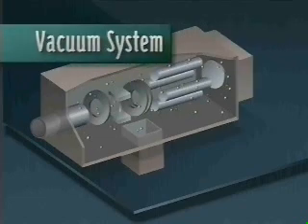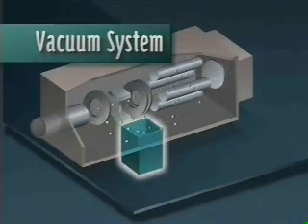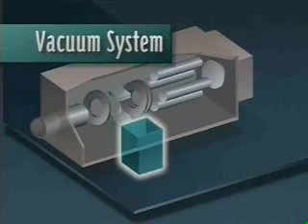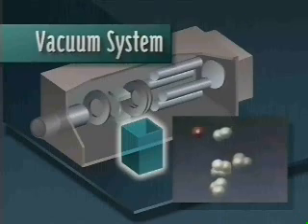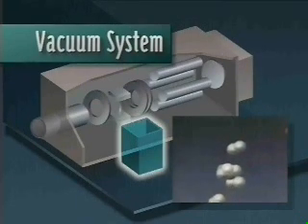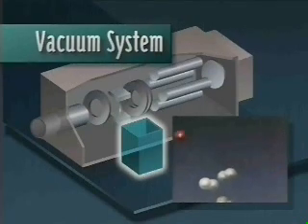The ion source, mass filter, and detector are in vacuum, so that a collision of a given ion with other sample molecules, air or water, is unlikely. Minimizing collisions ensures that the ions are efficiently mass selected and detected.